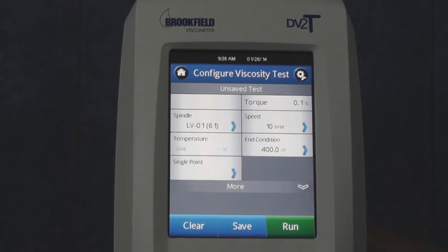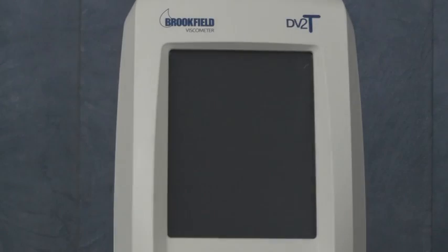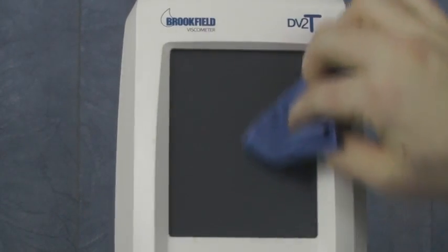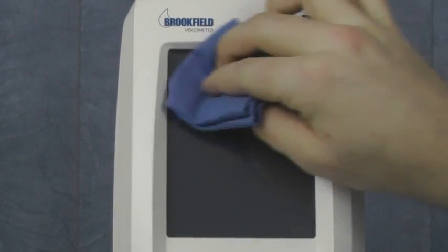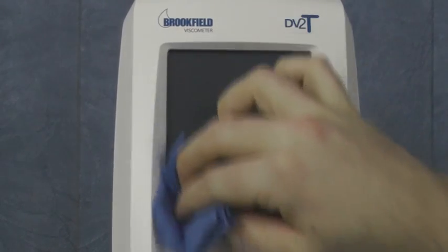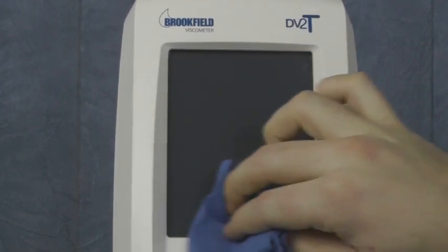You must first power off the viscometer. You then want to clean the viscometer's touch screen with the provided cloth. Any dust, debris or oil on the touch screen may prevent proper adhesion of the screen protector.